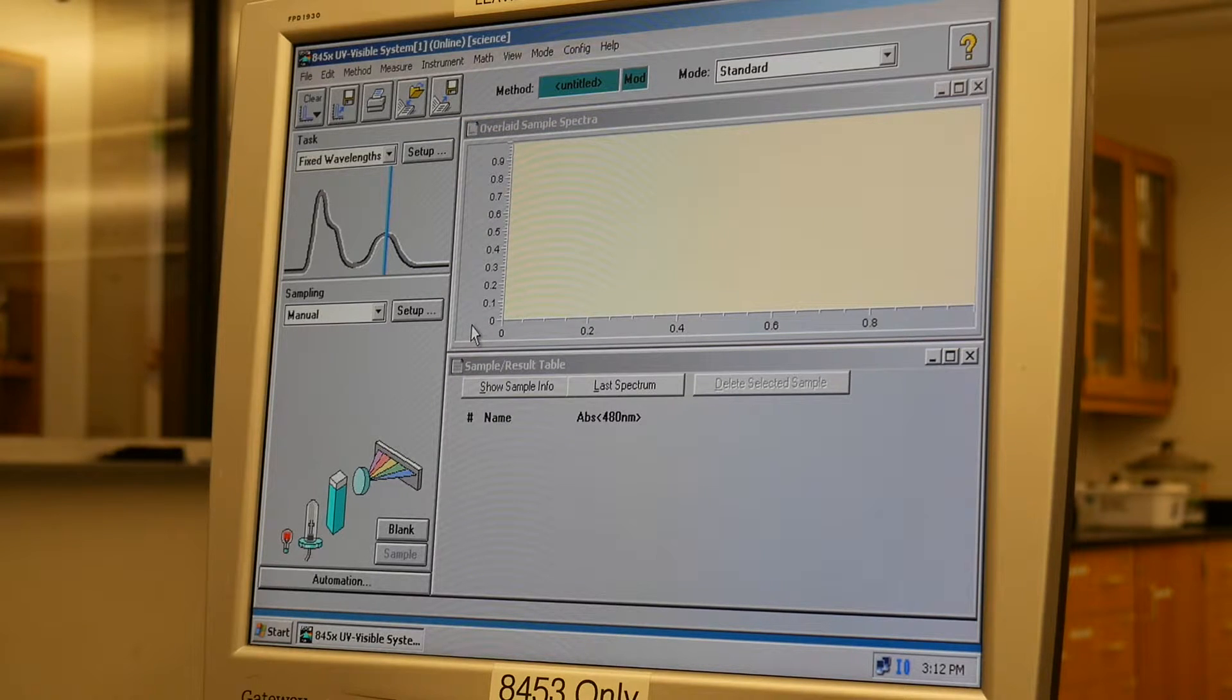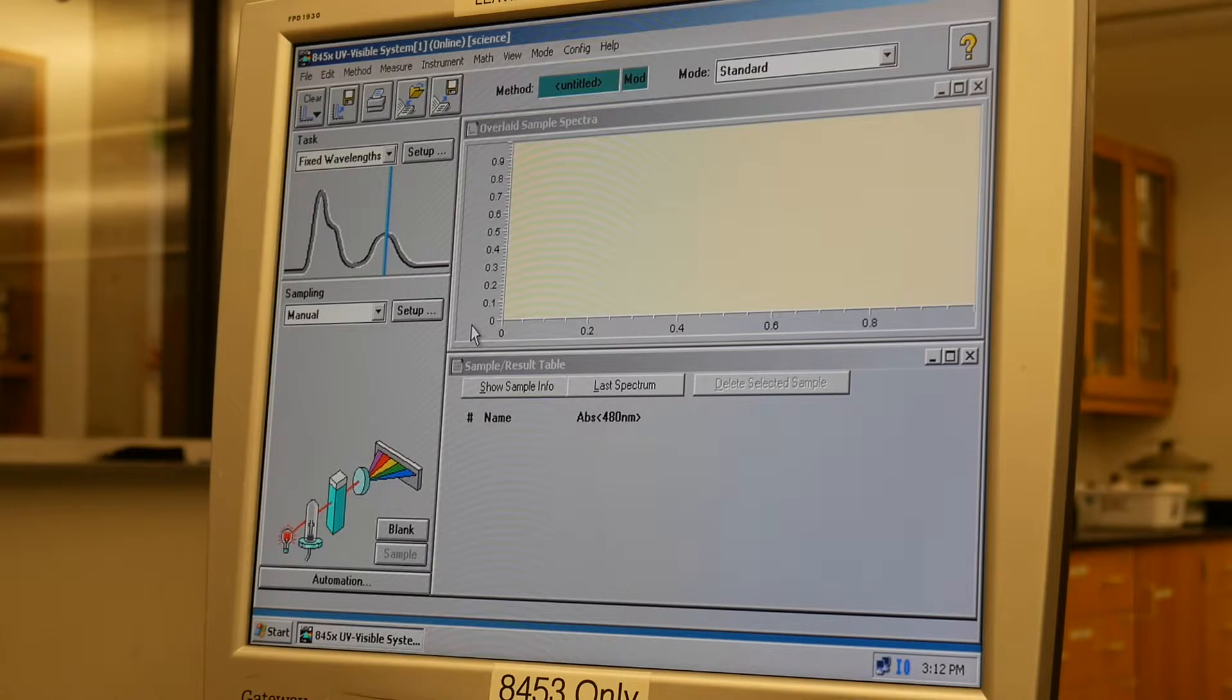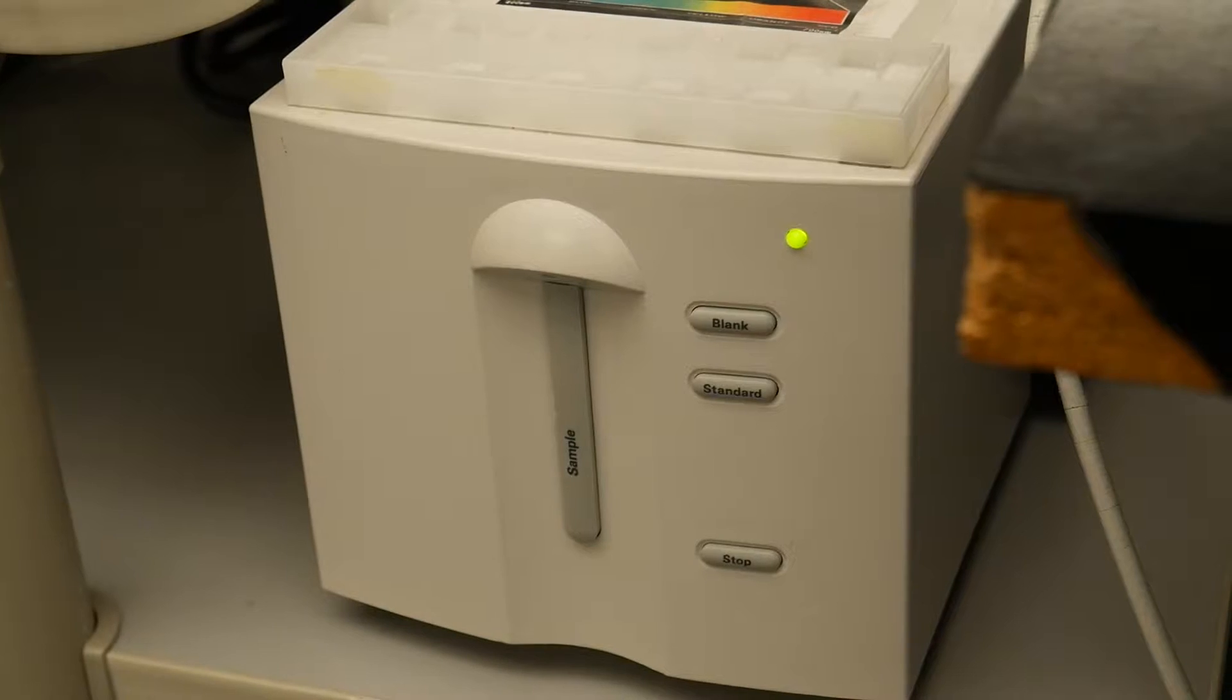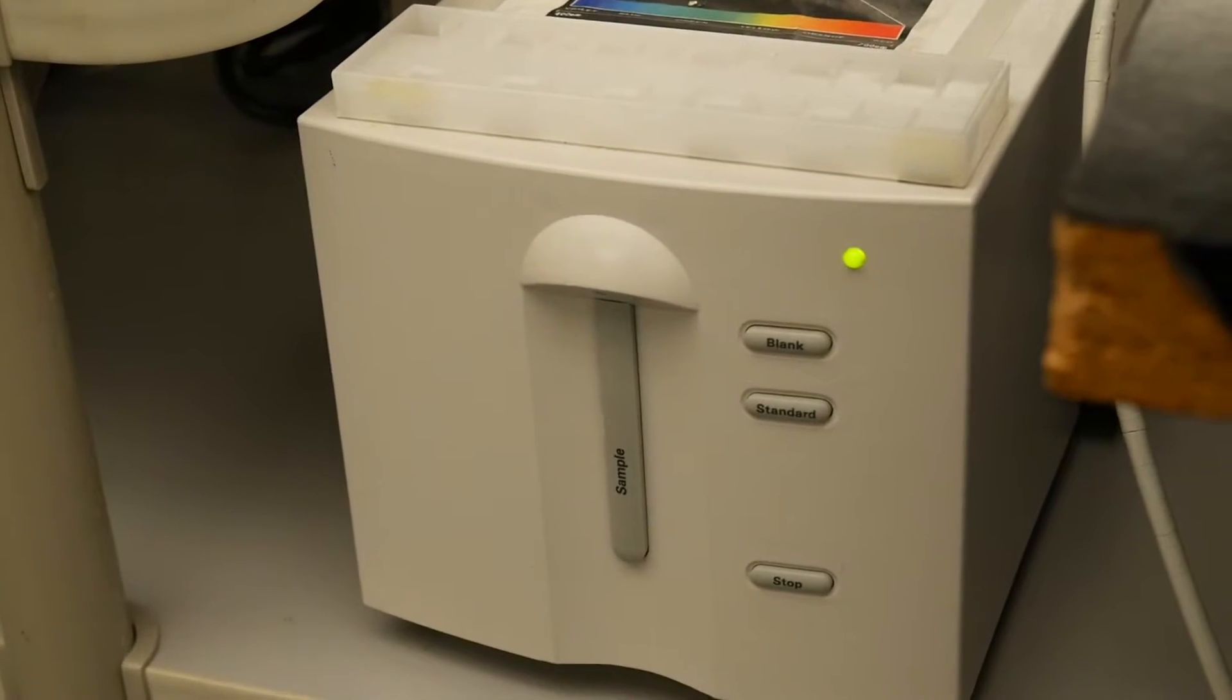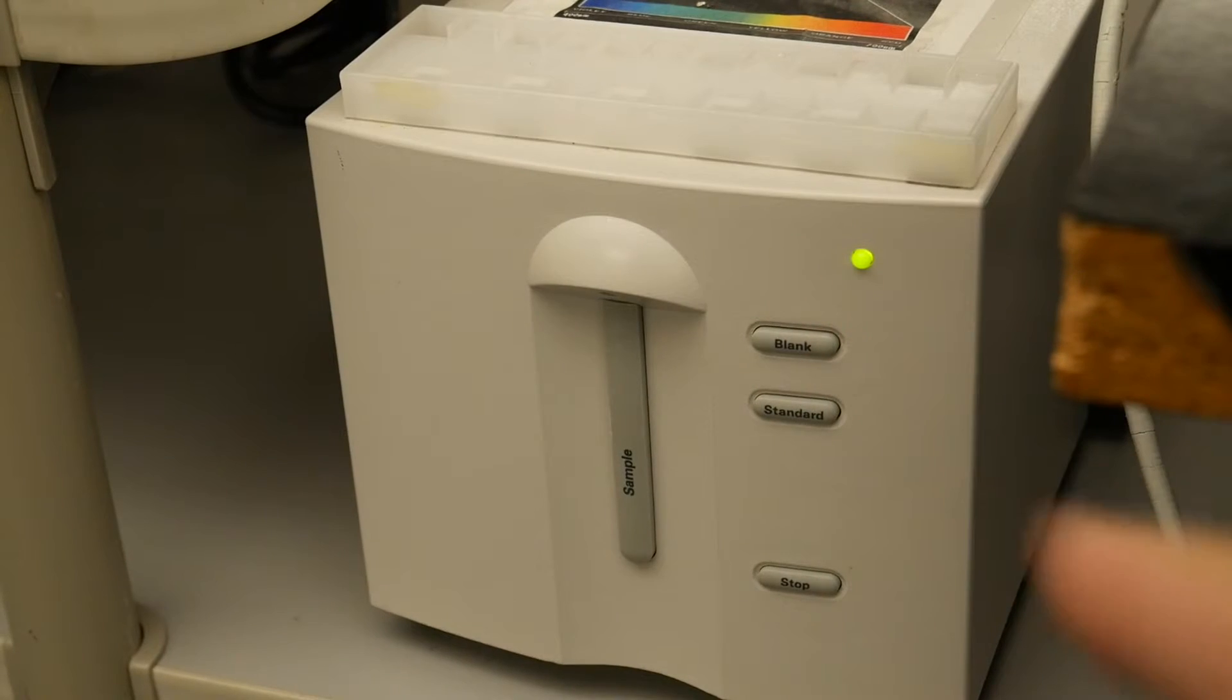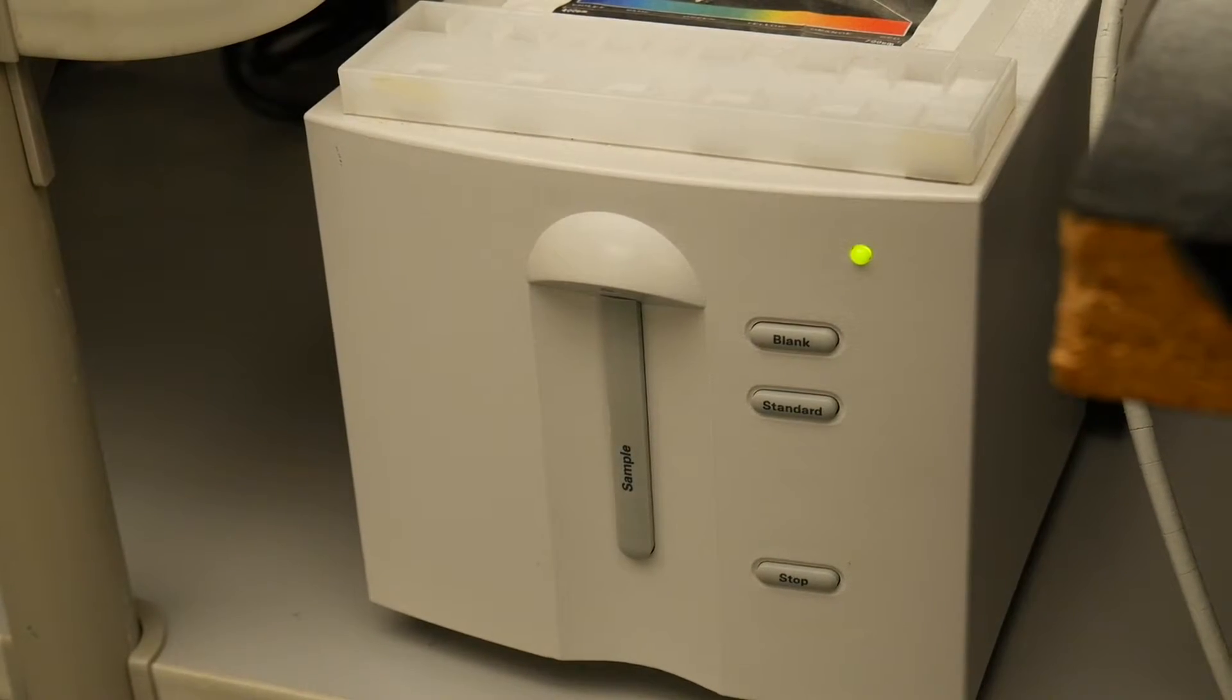Now I do want to say that it takes a while for the instrument to warm up. So at this point you can see that the light has turned green, and that means the instrument is ready to roll.